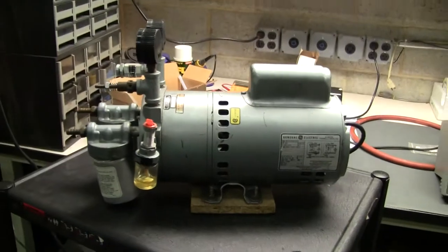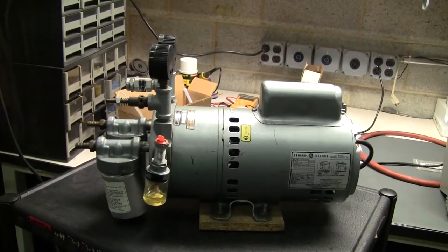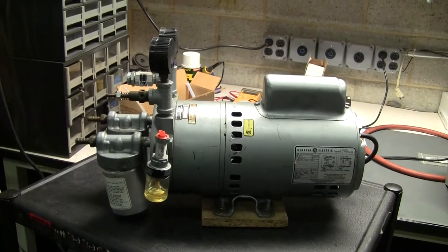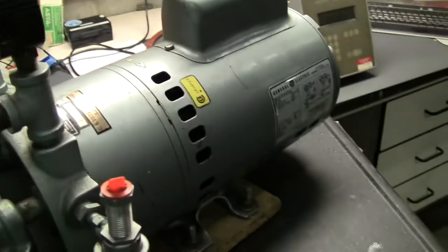This is a Fisher Scientific pump. We'll turn it on and see what kind of vacuum it pulls, and also look at the PSI that the compressor will put out. Let's turn this on.